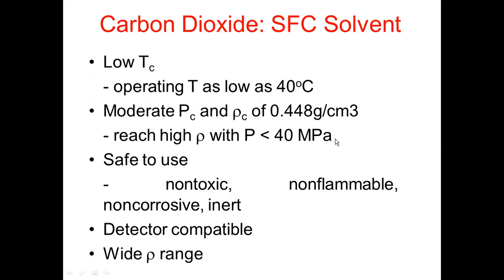So that's why carbon dioxide is an excellent supercritical fluid. Moreover, it is very safe to use because it is non-toxic. It does not catch fire, so it is non-flammable, and it does not exhibit corrosive properties. It is non-corrosive, and it is highly inert.